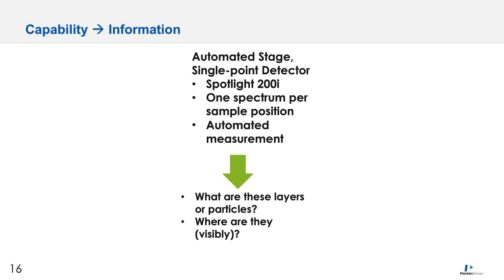The CCD camera provides the user with the ability to identify multiple regions of interest. And actually the software offers an algorithm which can be used to suggest areas of interest in situations where a large collection of debris or areas of interest are presented to the microscope.